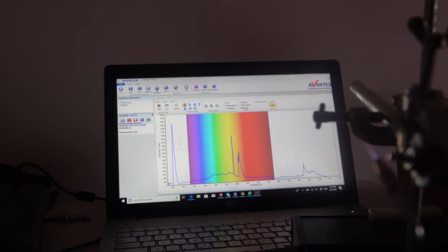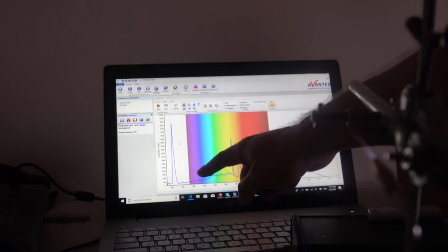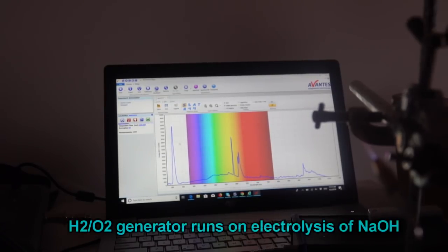Right? And it's difficult to actually tell whether you're looking at the base of the flame or the post-combustion, but either way, that's probably, if I had to guess, the one. Actually, I'm not so sure which one's giving you. So these are emission lines. So obviously, looks like you've got the sodium emission line there, and at some point, that's not unsurprising.